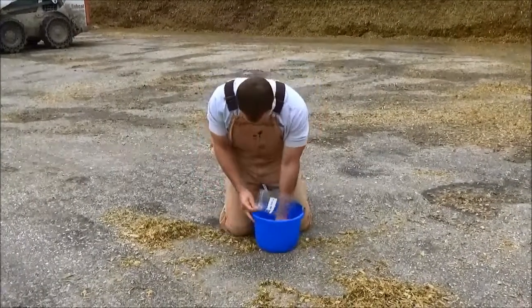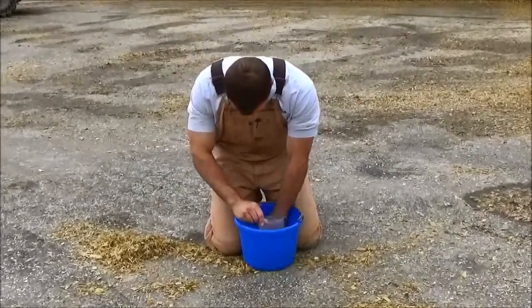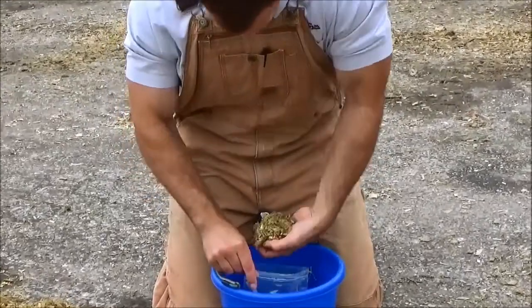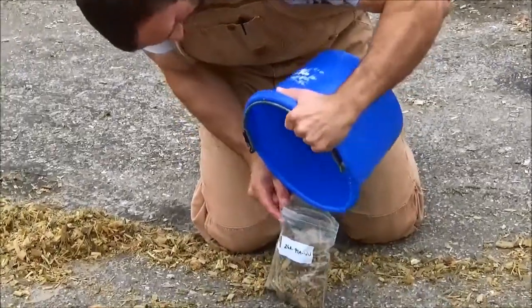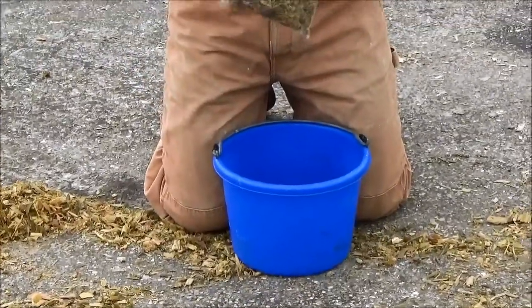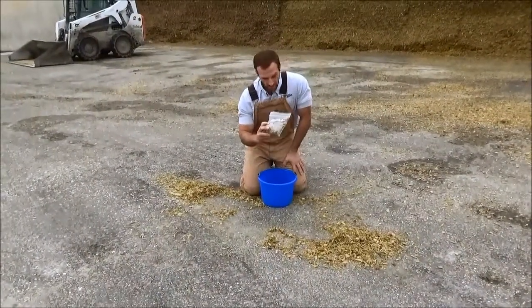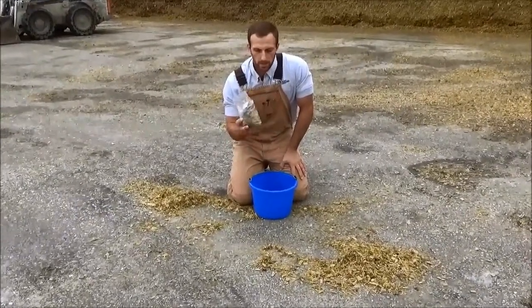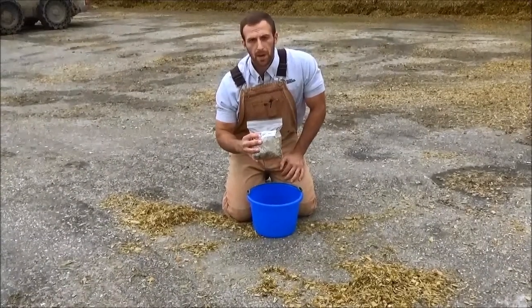I'm going to empty the whole contents out of the bag. This is going to be an ideal sample size for a laboratory — really all that's needed to do nutritive work, energy analysis, kernel processing score, and potentially yeast and mold testing. Anything we might want to look at on a sample of this size is more than adequate. That's about one pound — about 500 grams.